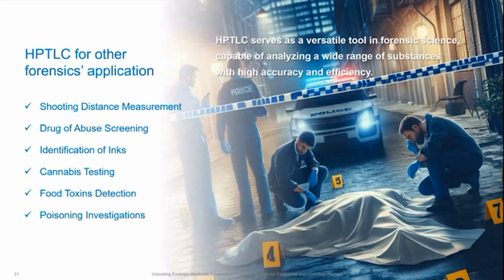This was a nice explanation, and I think everybody sees the advantages of HPTLC in this case. But HPTLC doesn't offer you just two applications. Having a system in your forensic lab allows you to do a lot of other applications. For example, the shooting distance measurement. When somebody gets shot and the shooter says he acted in self-defense, the distance between the shooter and the victim has to be measured. And there's a very effective way with a TLC plate to measure this.